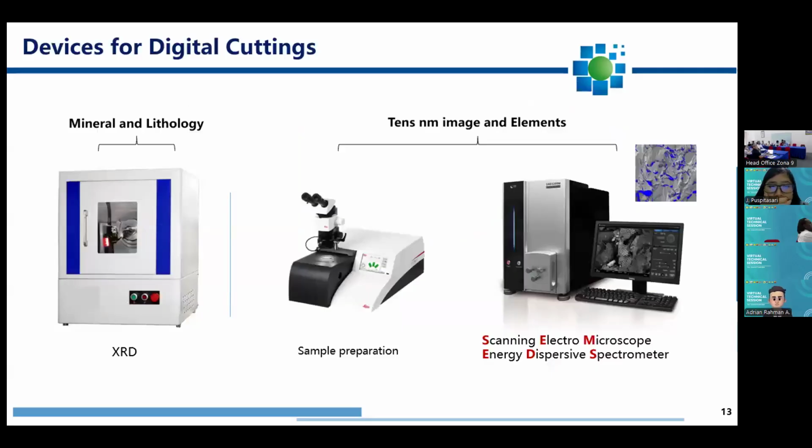These are other devices, XRD, XRF, which most of you are very familiar with, and also SEM, scanning electron microscope. We use these devices together with micro CT to get a more full-spectrum understanding of the rocks.